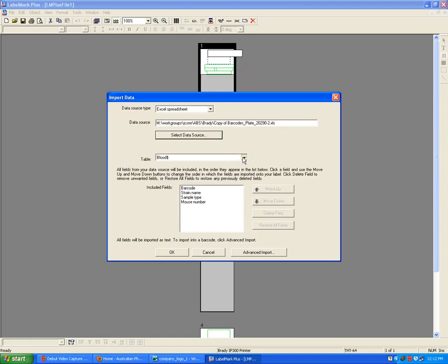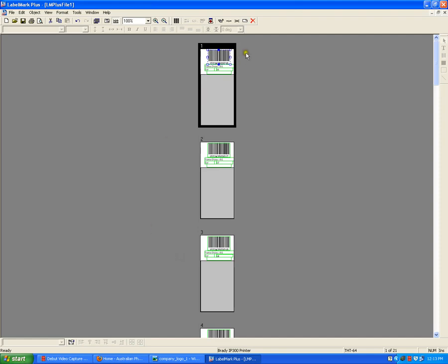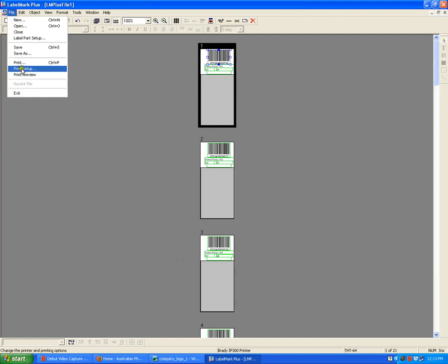Now, you can use any of these columns here depending on what samples you want. For example, ear. So all the different kinds of Brady samples are there. We'll select ear. Okay. And there you go. It's all populated. Now it's just a matter of printing them all out.